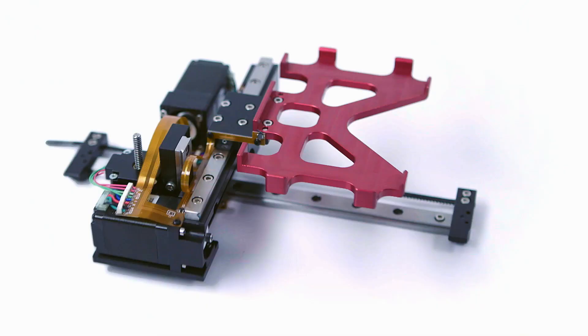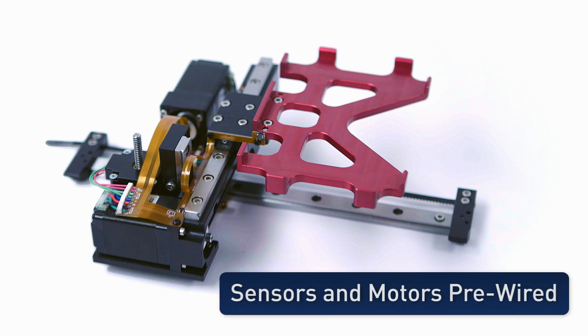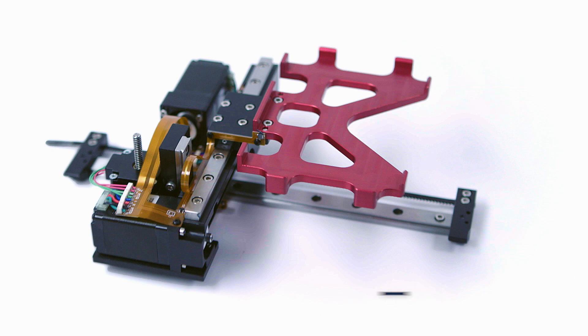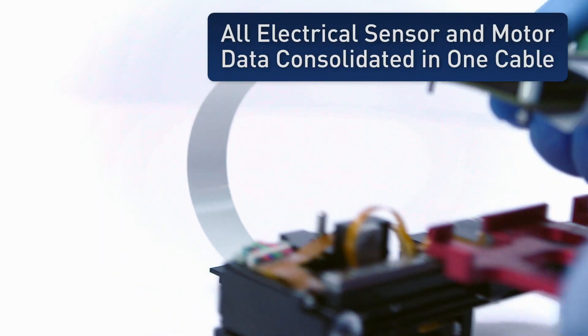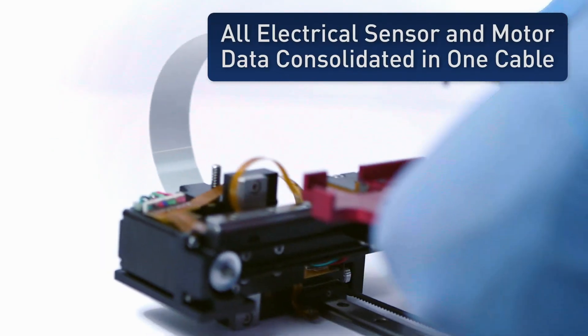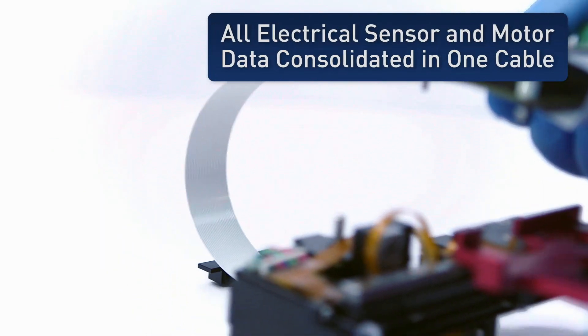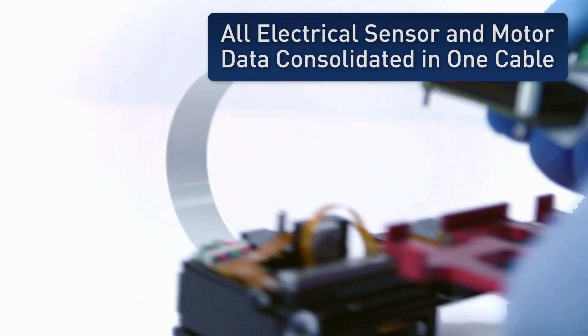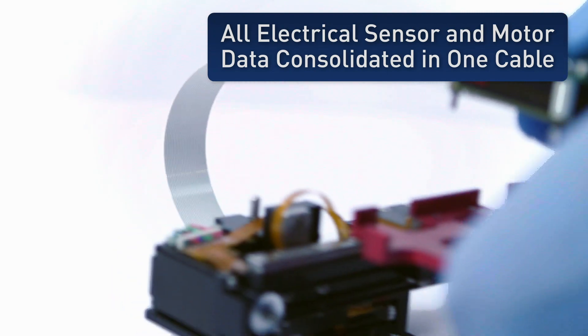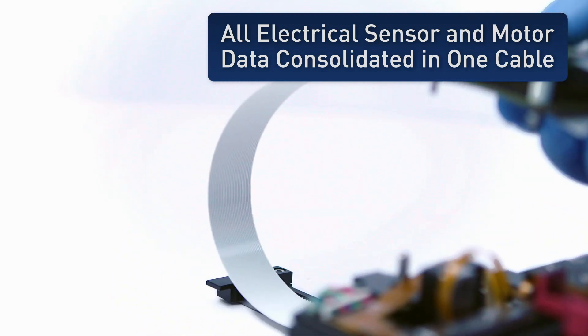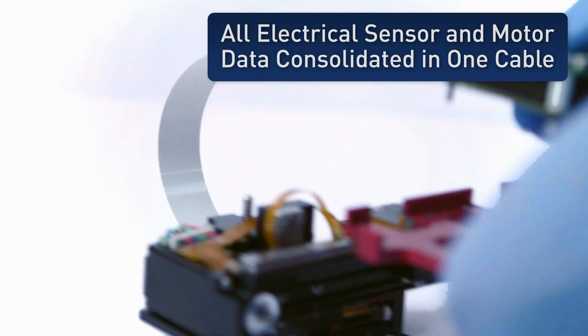One of the challenges of designing multi-axis systems is after putting together an elegant mechanical design, all the motors and sensors have to be wired, which makes a mess of the assembly. With TPA's plate robot, all the motor and sensor wires are consolidated into a single high-flex flat cable providing for a clean and reliable wiring of the system.